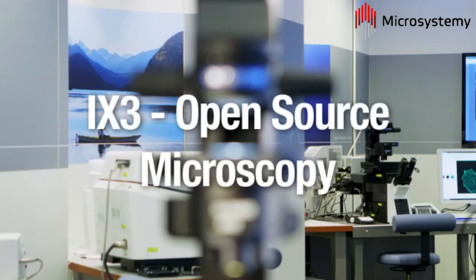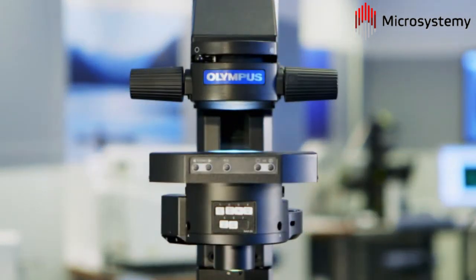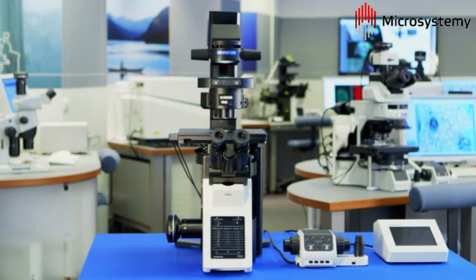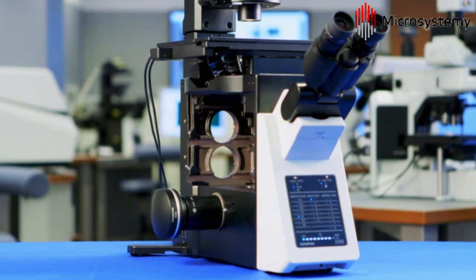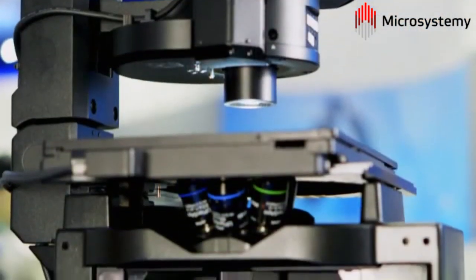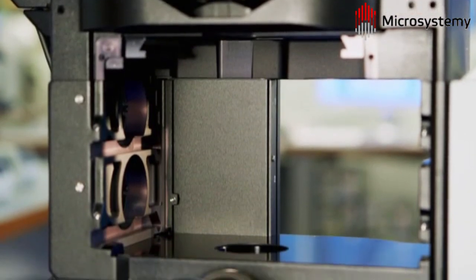Introducing the new open-source microscopy concept, Olympus presents the IX3 range of inverted microscope frames. A swappable deck design allows optical modules to be easily exchanged into the accessible infinite light path for a flexible imaging system that can be molded to suit the diverse needs of the user.